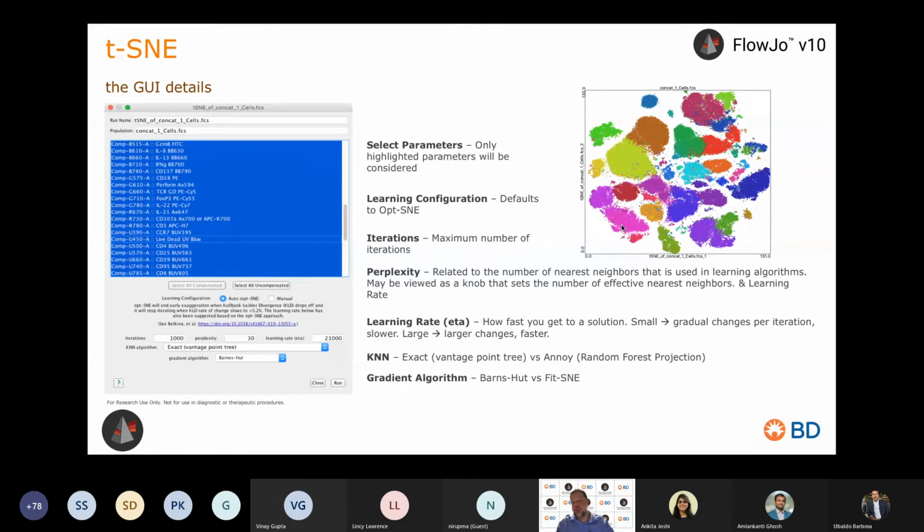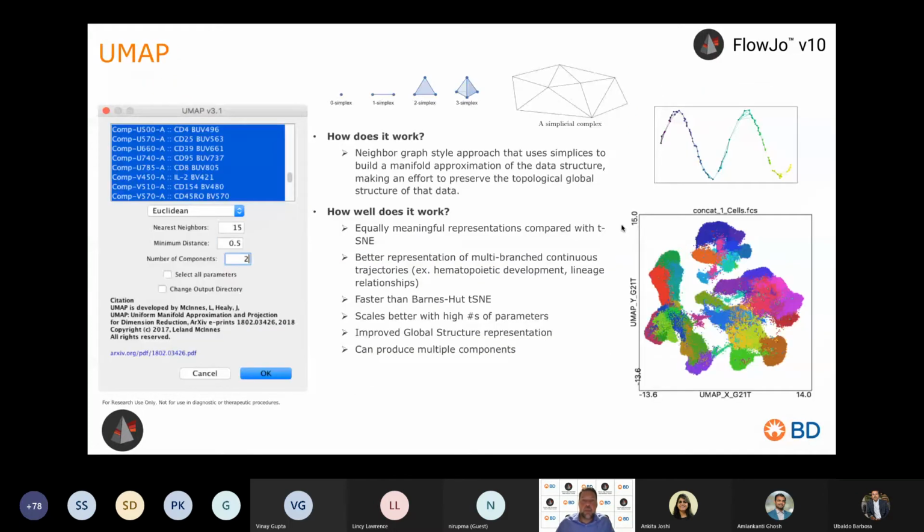You'll need to go to a bigger computer with more power, more cores, more RAM, memory is the key function here, to run a multi-million event or a 10 or a 20 million event t-SNE. So therefore, you want to downsample to maybe a couple 100,000 events to get t-SNE to complete on your laptop.